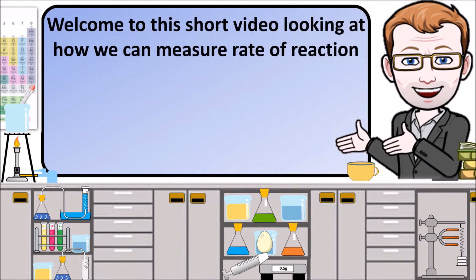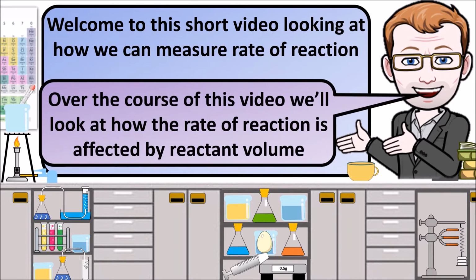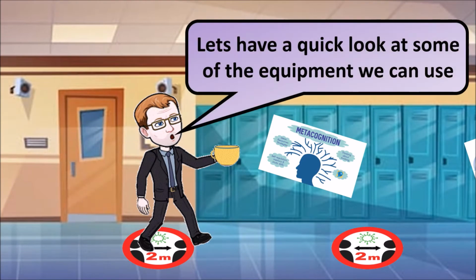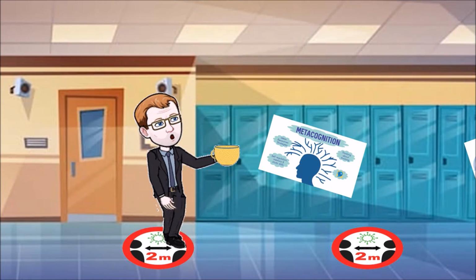Welcome to this video looking at how we can measure the rate of reaction. In this video we are going to look at how the rate of reaction is affected by reactant volume. So let's have a quick look at some of the equipment we can use.